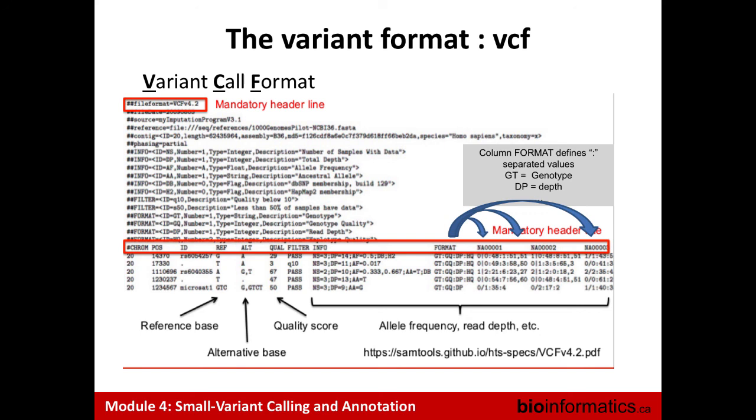Usually, if your run works well, you don't have such a batch effect for variant calling. After that, we observe some batch effect sometimes because we have a failure of the HVAC in the building during a run. Yes, that would be something to take into account. But if you are in a sequencing center that runs in a production mode, same instruments, same libraries, probably same technicians, it should give quite a similar result. And you still keep the information of batch somewhere. So if you start to see some variants that pop up specifically in a batch, I would say perhaps that's a batch effect, but by default, I would not put too much pressure on it.